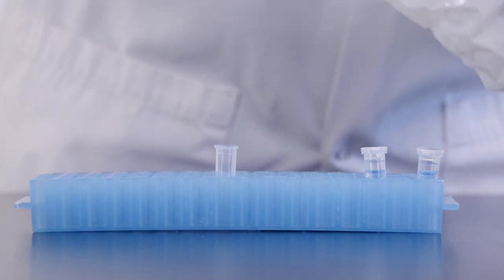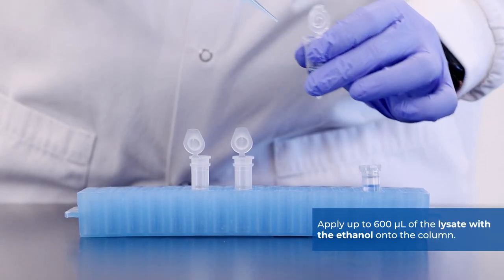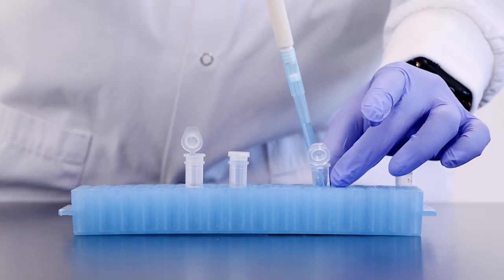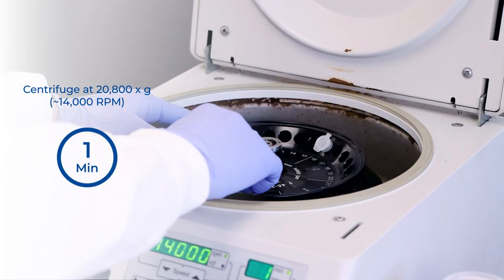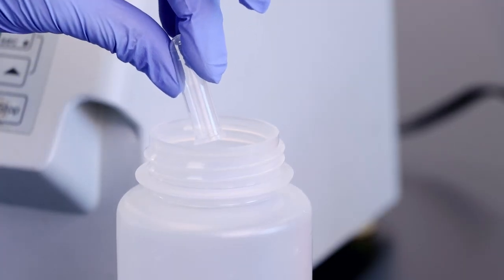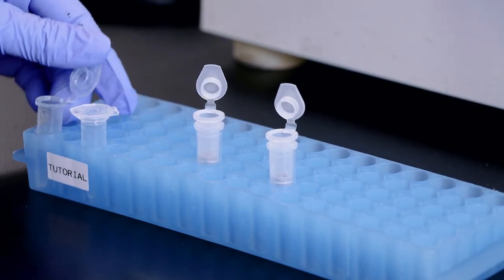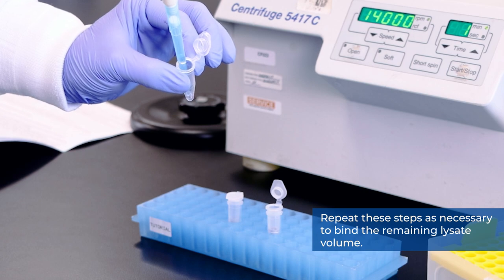Assemble a spin column with one of the provided collection tubes. Apply up to 600 microliters of the lysate with the ethanol onto the column, and centrifuge for 1 minute at 14,000 RPM. Discard the flow-through and reassemble the spin column with its collection tube. Depending on your lysate volume, repeat these steps as necessary to bind the remaining lysate volume.